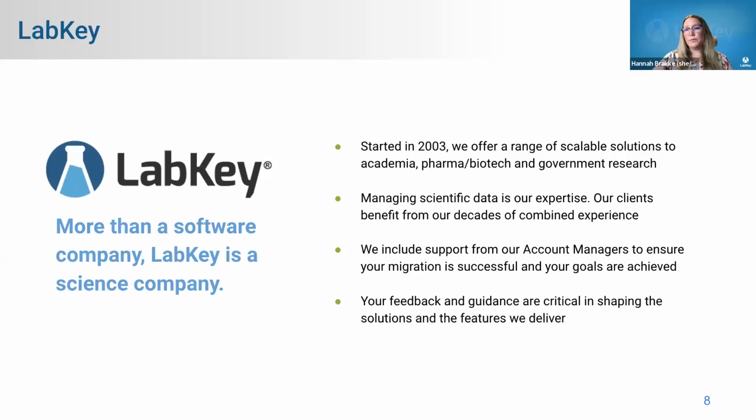Okay, great. And the last question here is, how are LIMS priced? This can vary a lot in the industry as well. Some of them can be on an annual basis pricing, and so that's something you'll want to look at and see if that's something your lab can digest. Some of them are very modular, so you can pick and choose what functionality you need. Sometimes that can get very expensive very quick, because all of a sudden you've added 5 different things and the price looks very different at the end. A lot of the more modern LIMS solutions are going to user-based pricing, again, to really keep that entry level cost as small as possible for labs, so you can try something out with a very low cost burden for your laboratory.